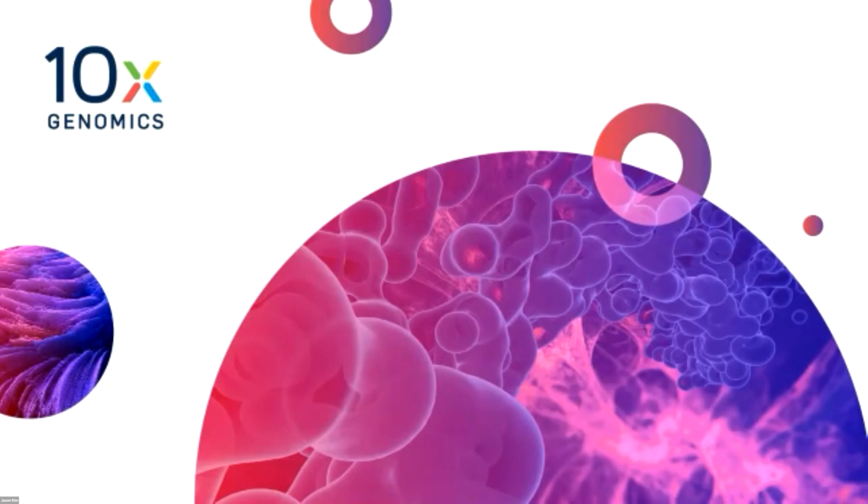And so there's a center to center distance of 100 microns. So there's a little bit of a dead space. And if there is any lateral diffusion, again, with the asterisk that optimization for permeabilization has been done, the diffusion should not cross over to where you start seeing bleed out of data into neighboring spots such that it convolutes the data even more. And I can send that paper to everyone in the group just to have that as a read and reference.